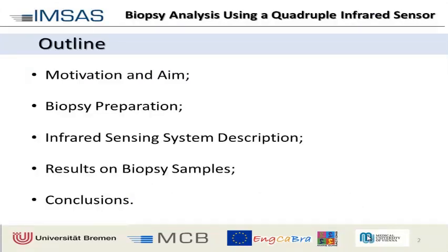So, first, an overview of the presentation. I want to show you first the motivation and the aim behind our research project. Then I will explain how the biopsies are prepared for infrared analysis. I will then describe what the infrared sensor looks like and the sensing method behind it. Then I'll go over the results obtained, conclusions, and future plans.